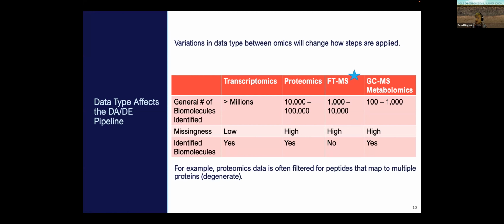which is why I think differential abundance is not commonly used for FTMS, but I'm here to show you that there are things we can do with it, specifically when we get to the class information, that e-meta information that we store. For example, from Daniel's examples, we saw with the Van Krevelen plots, you could get families from each of the groups, like cholesterol, for example, and we can use that information after we get statistically significant peptides, metabolites, or compounds in this case for FTMS.